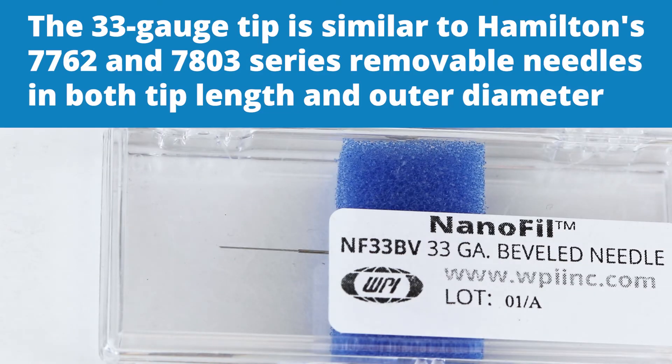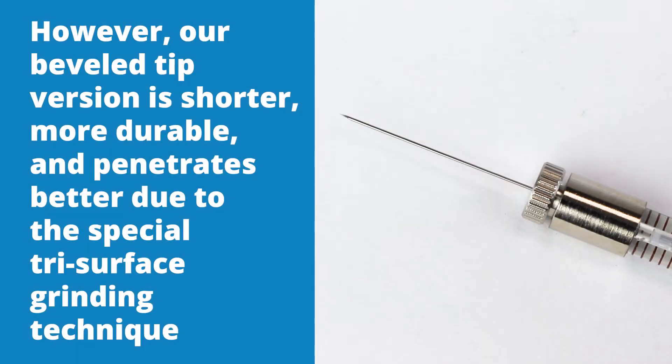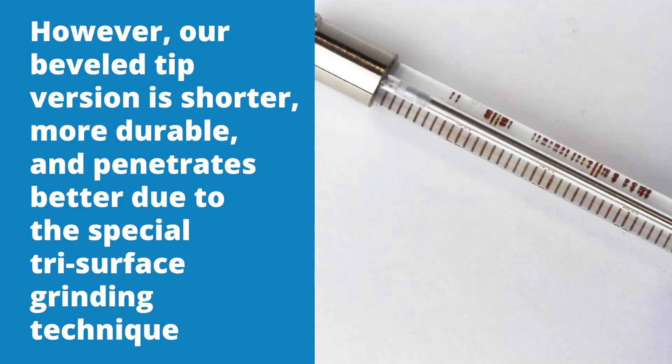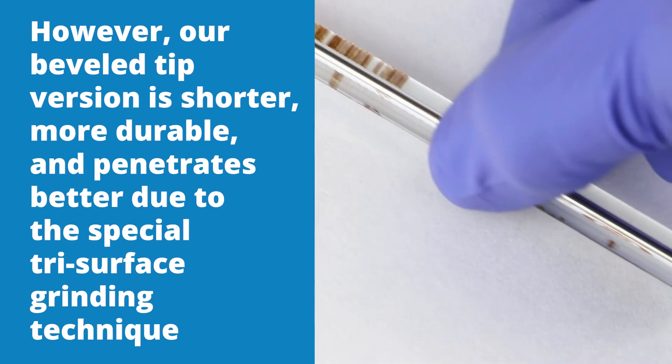The 33 gauge tip is similar to Hamilton's 7762 and 7803 series removable needles in both the tip length and the outer diameter. However, our beveled tip version is shorter, more durable, and penetrates better due to the special tri-surface grinding technique.